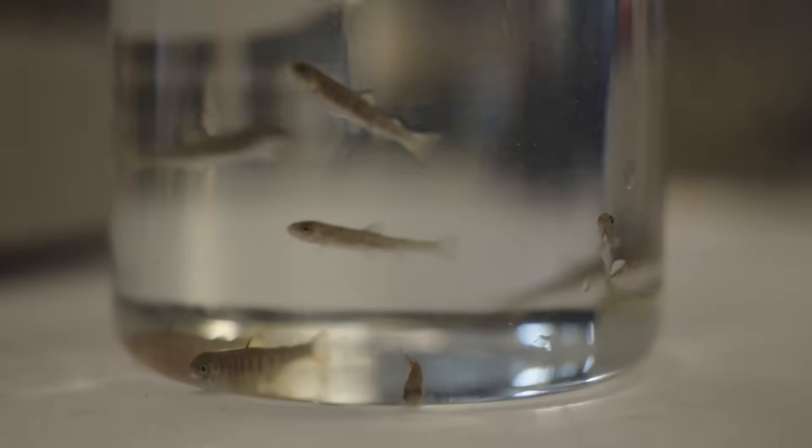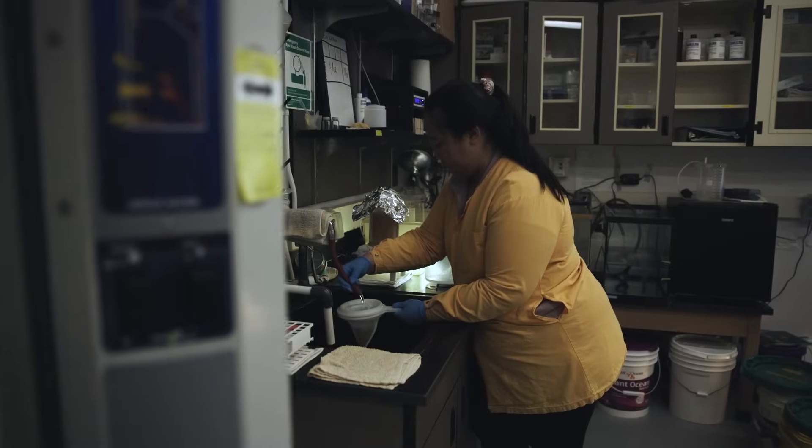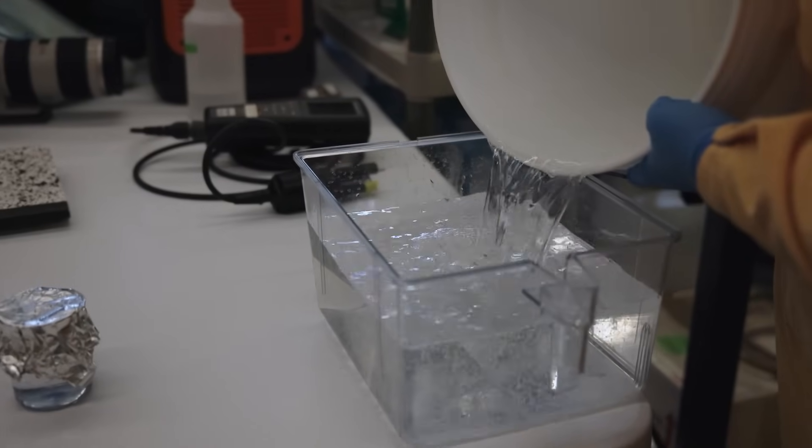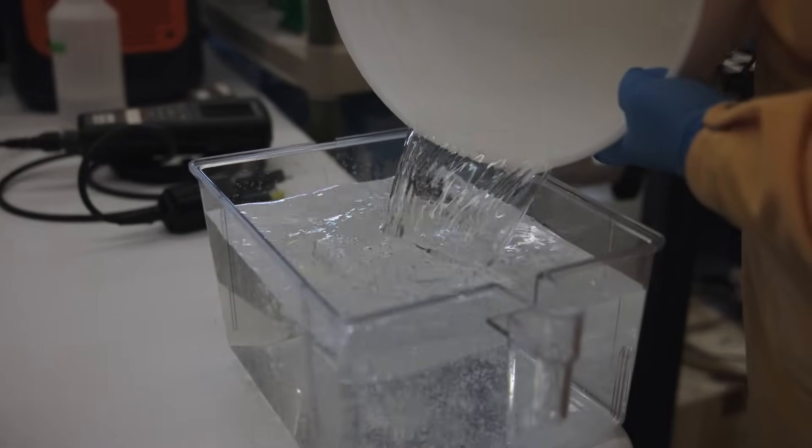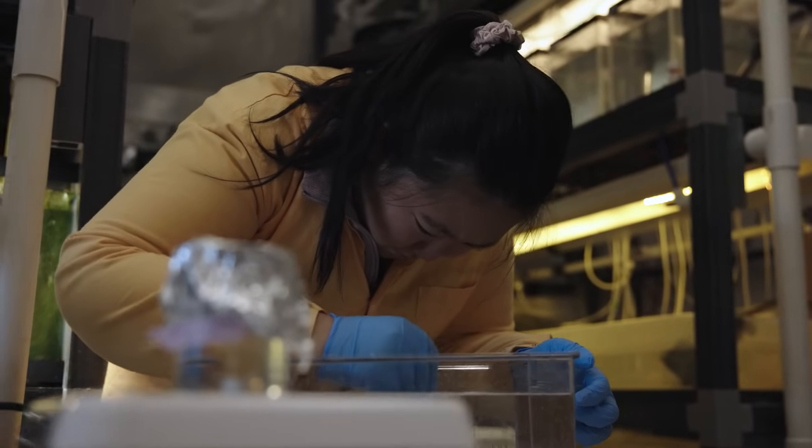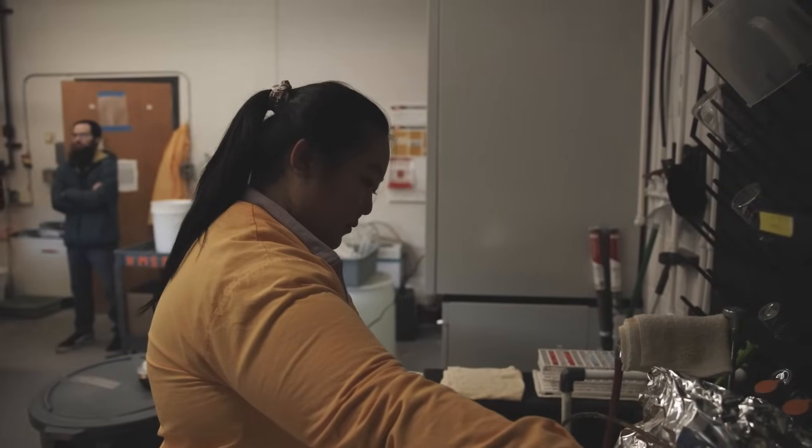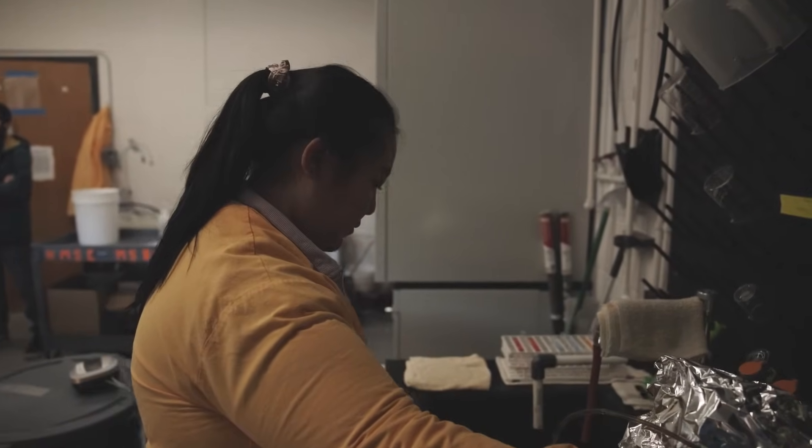In the lab we use organisms like silversides and mysid shrimps and perform these standard toxicity tests where we expose them to microfibers, to tire particles. We're beginning to see impacts on things like their growth and behavior, and hopefully that can give us some insight into what kind of effects eventually it has all the way up in these larger systems.